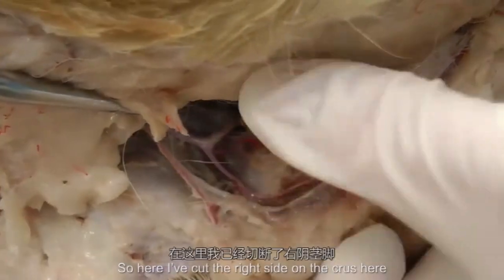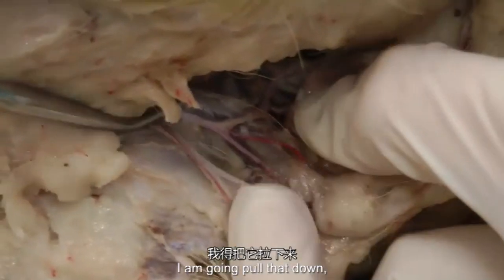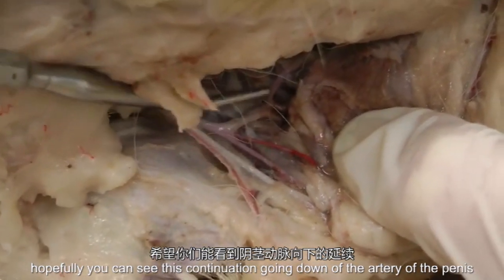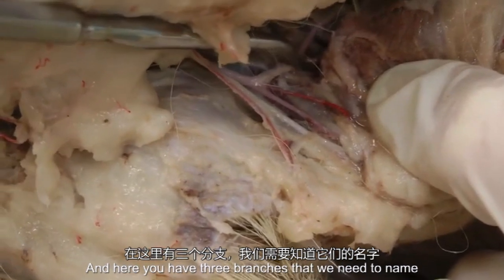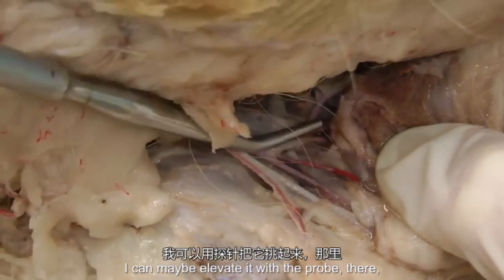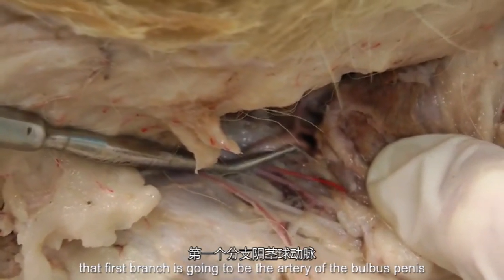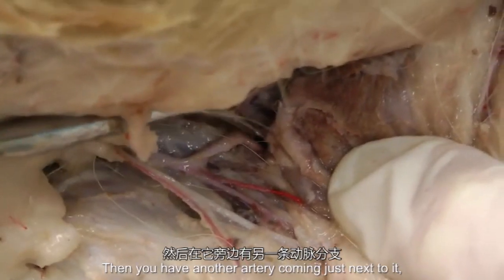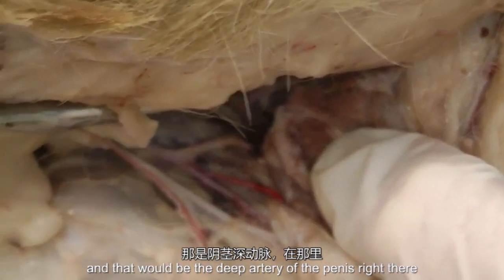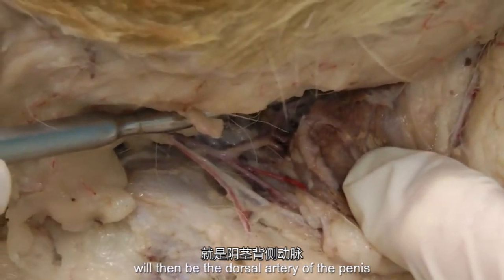So here I've cut the right side on the crus here. The right crus has been cut, and I'm going to pull that down. Hopefully you can see this continuation going down of the artery of the penis. And here you have three branches that we need to name. This first branch coming off right here, if I can maybe elevate it with the probe, that first branch is going to be the artery of the bulb of the penis. Then you have another artery coming off just next to it, and that will be the deep artery of the penis right there. Then this third piece that continues down will be the dorsal artery of the penis.